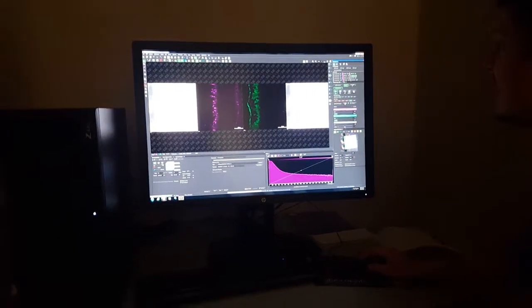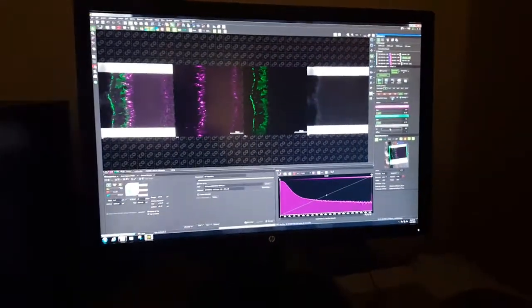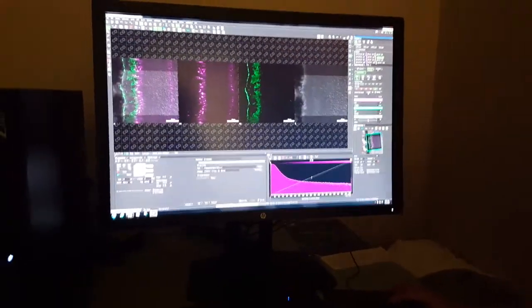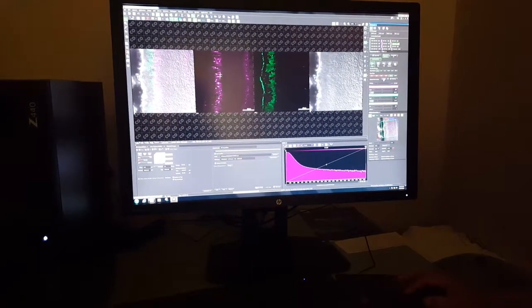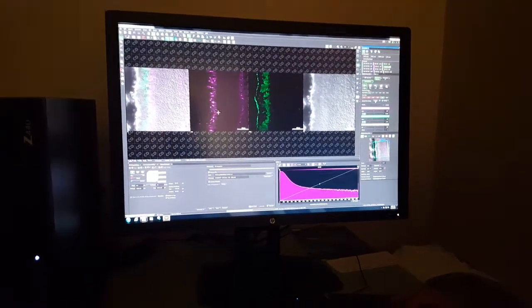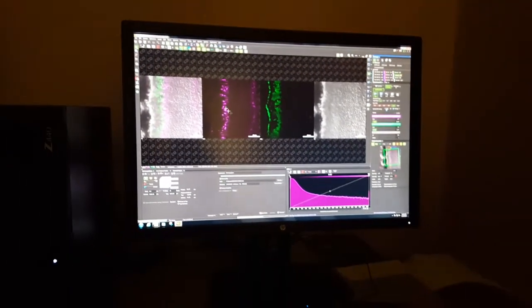What we can see here is the DIC is oversaturating. Decrease it and increase it a little bit to have something that we like. Someone else will like it. In this case, we are using PNA 680, that is lectin, and we have some staining. It's not super nice because the structure of the retina is not good, but perhaps we will have something better.